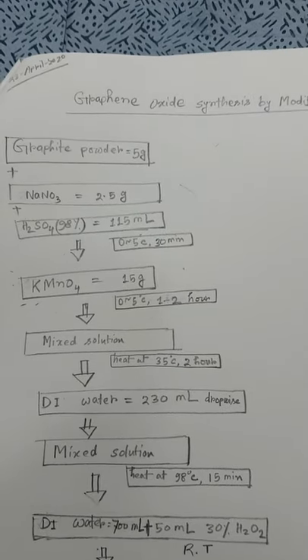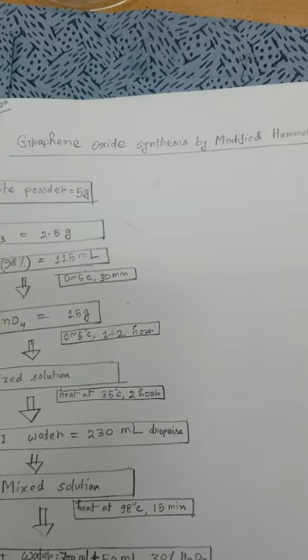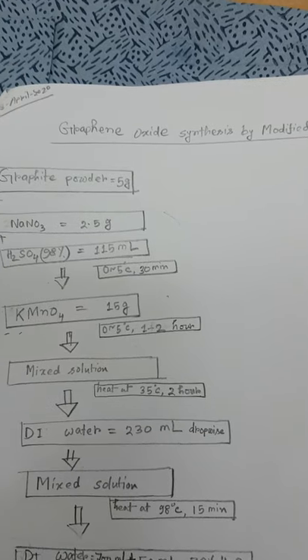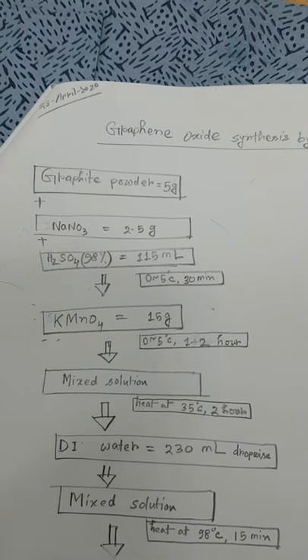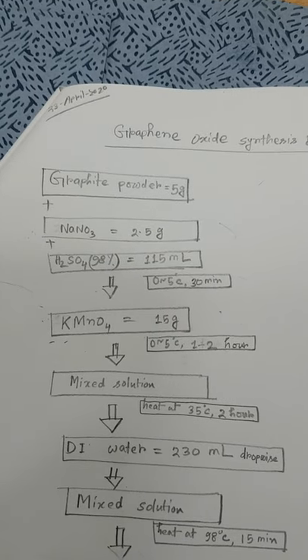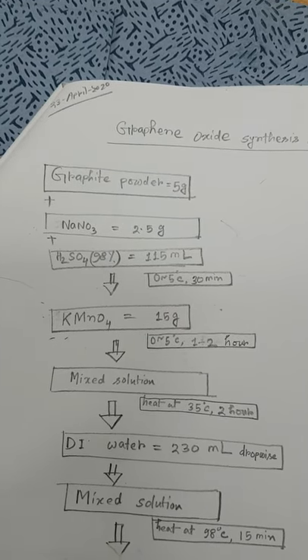I am synthesizing graphene oxide by the modified Hummers method. It's actually the graphite powder that is oxidized by potassium permanganate.